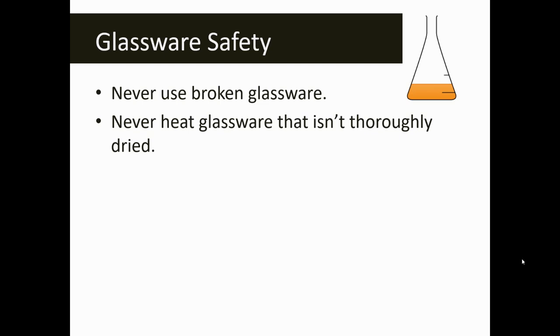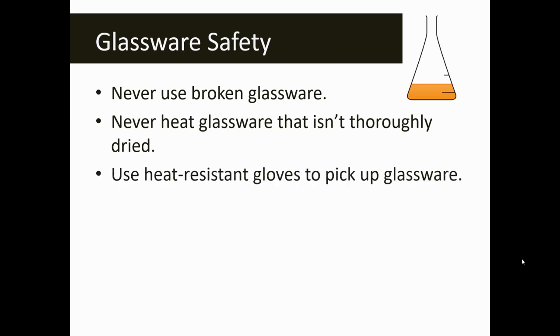Glass tends to shatter when it's wet and then introduced to something with the opposite temperature. So if you have cold glassware and it's suddenly introduced to something hot, like a hot plate or a Bunsen burner, that glass will shatter. Make sure that you don't use wet glassware when you are about to heat it.